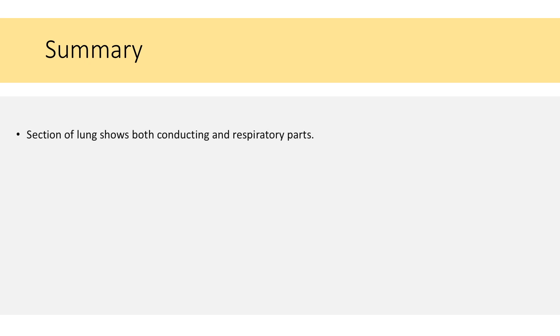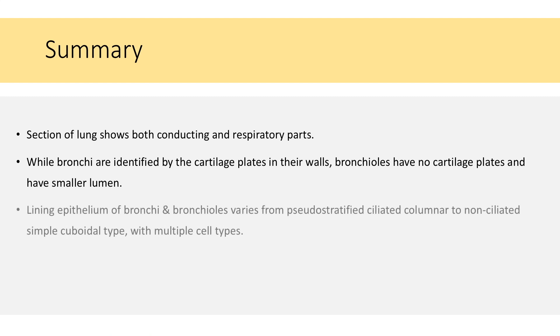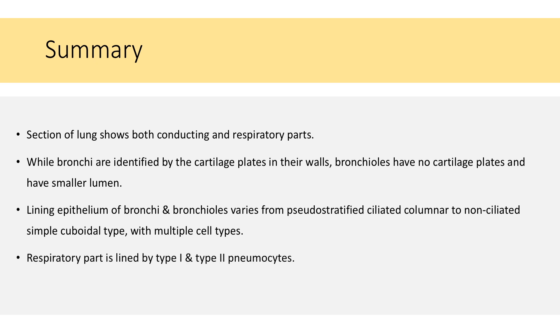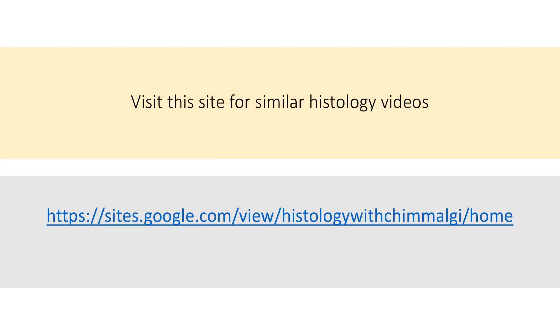In summary, sections of lung show both conducting and respiratory parts. Bronchi are identified by cartilage plates in their walls, while bronchioles have no cartilage plates and have a smaller lumen. The lining epithelium of bronchi and bronchioles varies from pseudostratified ciliated columnar to non-ciliated simple cuboidal type with multiple cell types. The respiratory part is lined by Type 1 and Type 2 pneumocytes. Between the alveolus and the capillary in the interalveolar septum, gases must diffuse across the blood-air barrier. Thank you — hope you find this video useful. You can also visit this site for similar histology videos.